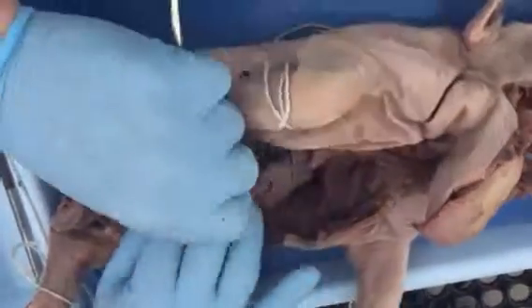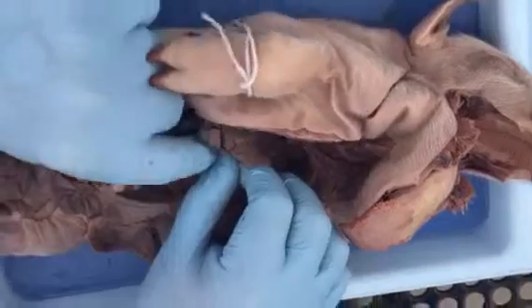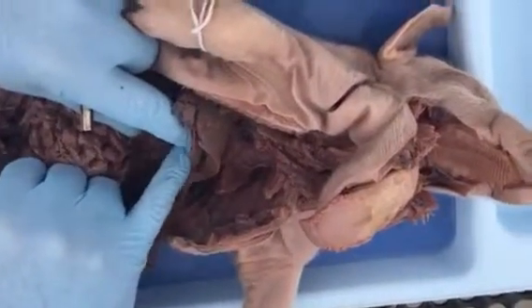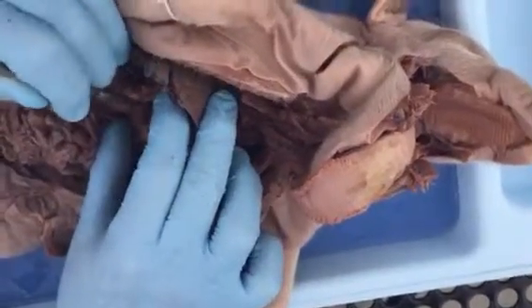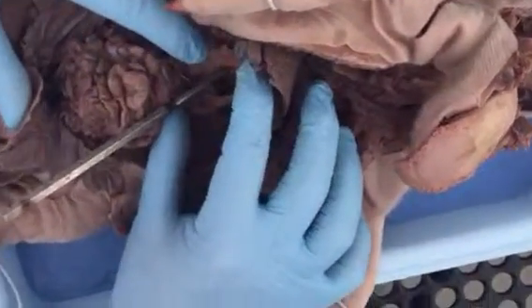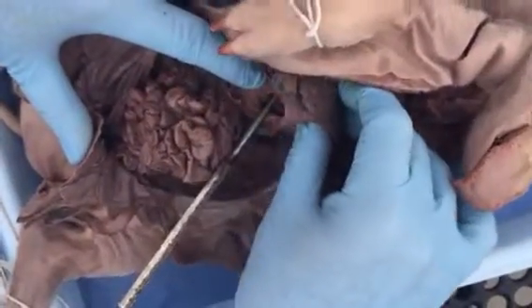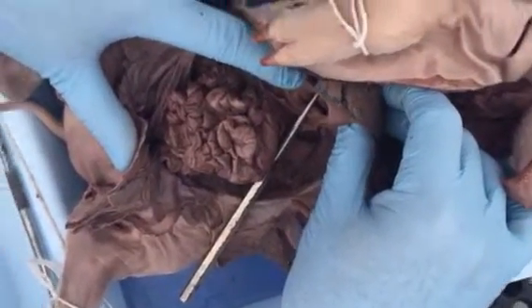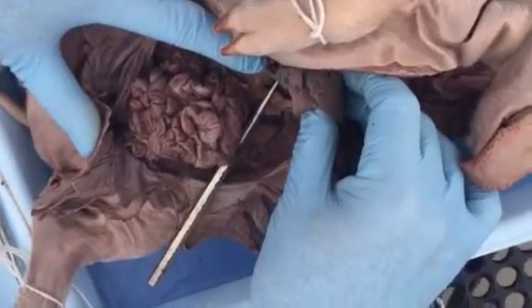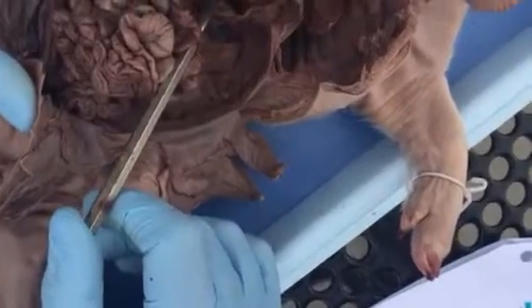Okay, the stomach has been cut open for you. Basically where my finger is now, where it's rotating around, that's the fundus of the stomach. There's 2 regions you need to know though. So where my probe is right now is in the cardiac region. It's closest to the heart, and my probe now is surrounded by the cardiac sphincter. So on the practical, I'm gonna say specifically either name the region or name the sphincter. Okay, so that's the cardiac region, but the probe is going through the cardiac sphincter.